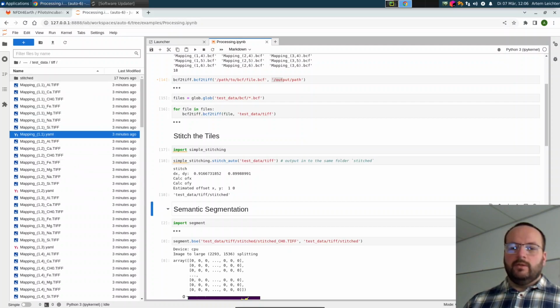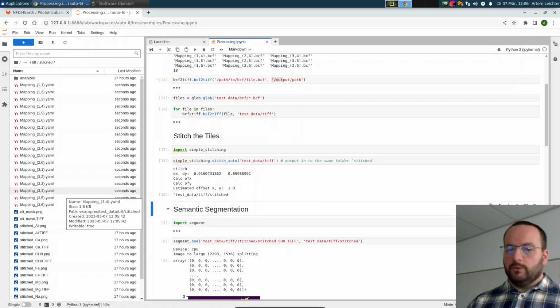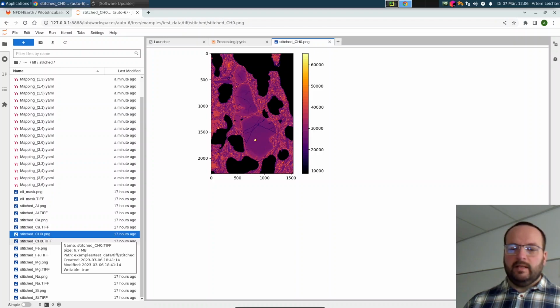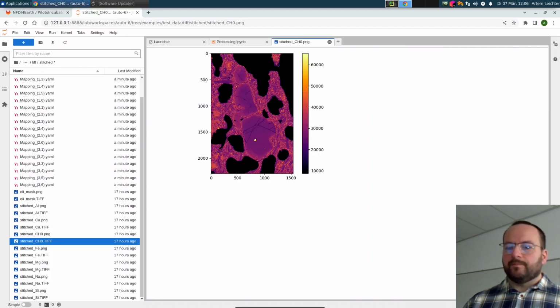Let's take a look into it. We have first of all the YAML files copied there, not to lose meta information, and also the visualization of the backscattered electron microscope data and the original raw data, which is again hard to visualize.